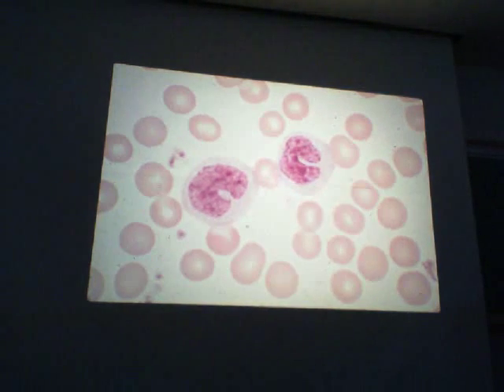That is a lymphocyte as well, a little bit larger. And how about these cells? Those are monocytes. Textbook monocytes, horseshoe-shaped nucleus, a much finer texture to the nucleoplasm, kind of a foggy cytoplasm. Those are textbook monocytes.